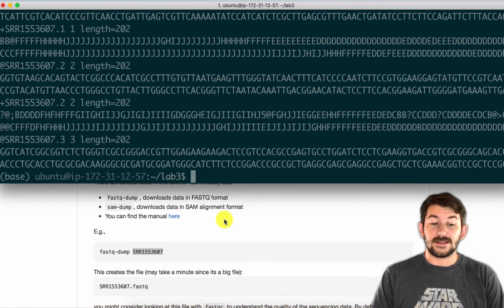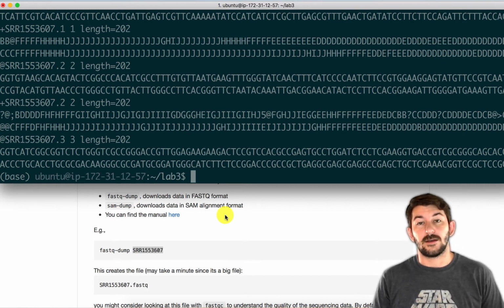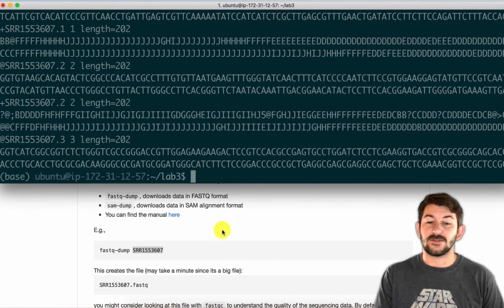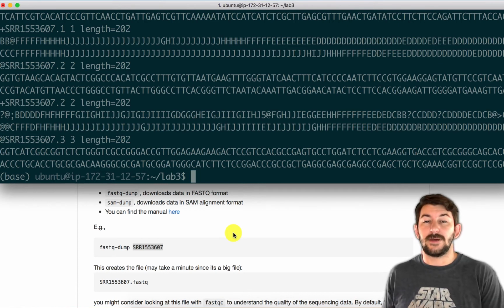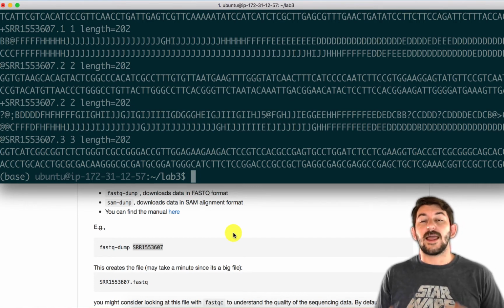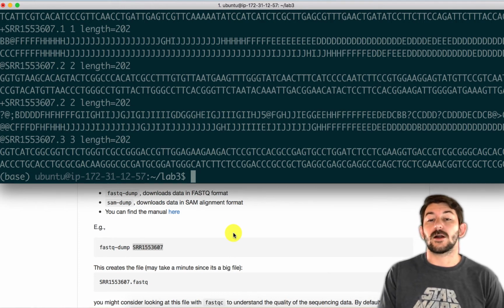So we've got that. Now, something I didn't tell you about this file is that this file is actually from paired end sequence data. And again, we haven't learned too much about the difference between single end and paired end, but know that paired end are typically in two related files, typically designated with an _1 and _2, because you can think of them as, for any given read in there, as having a mate or a pair in the other file that is connected by some length of unknown base pairs. Often the length itself is known, but the base pairs between are unknown.